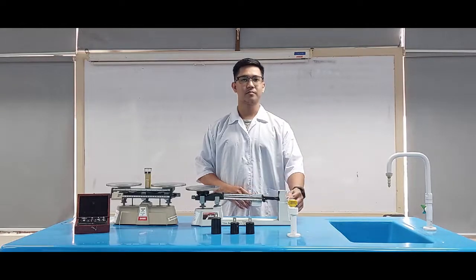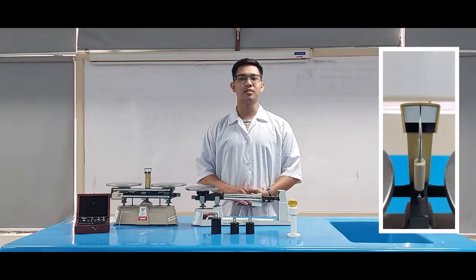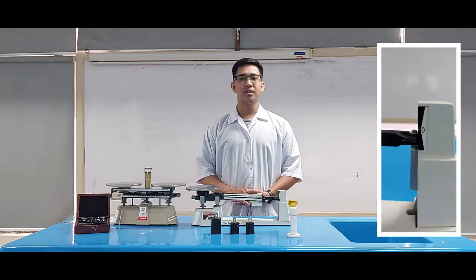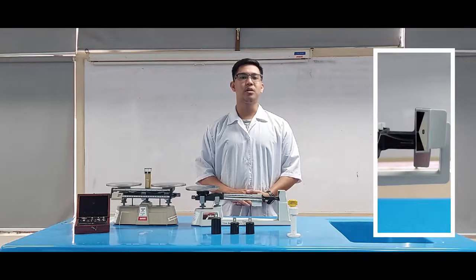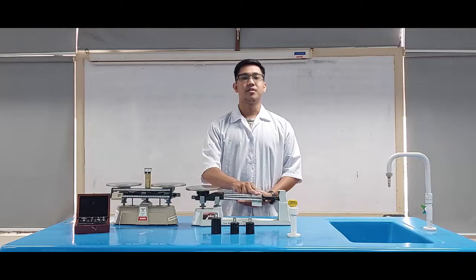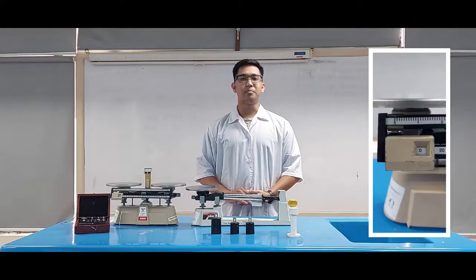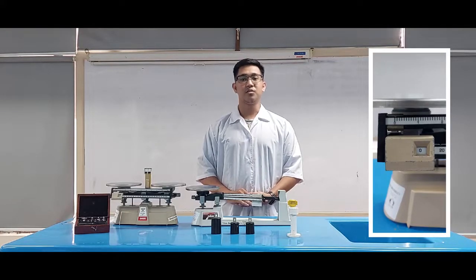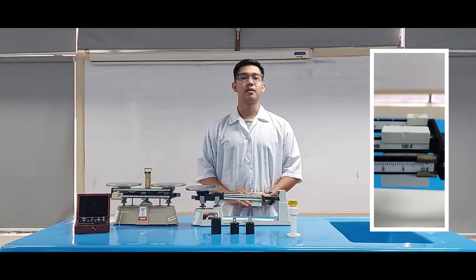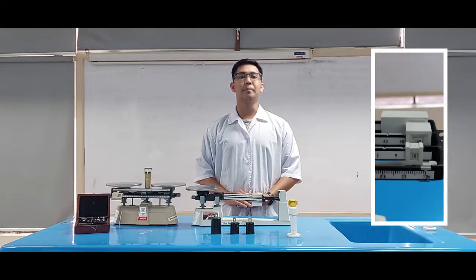The Pointer: the balance pointer marks the equal point of the object's mass on the scale and mass on the beam. It is used to indicate the correct mass of an object if it's leveled with the rider. The Riders: these are the sliding pointers placed on top of the balance beams to indicate the mass in grams. They are used to set the specific weight needed, and the number and weight of the riders differ depending on the beam balance.